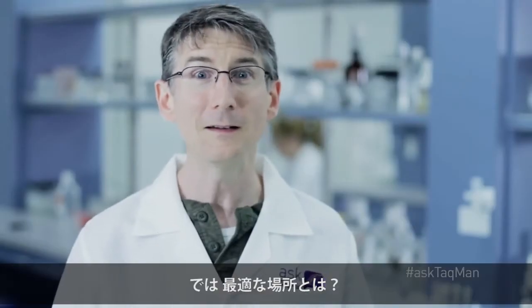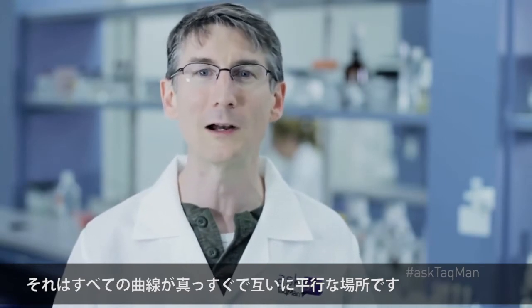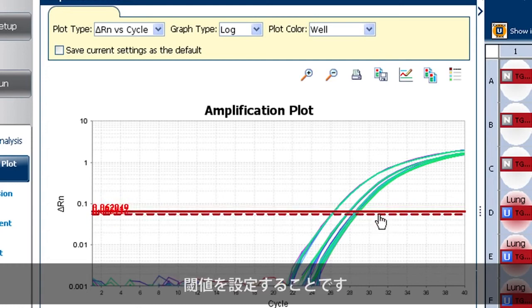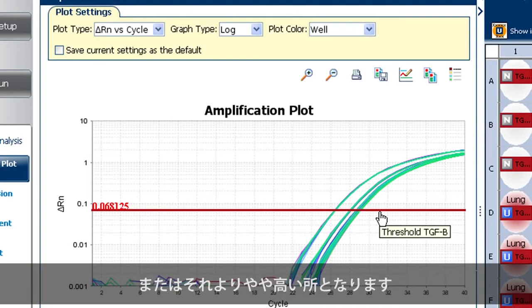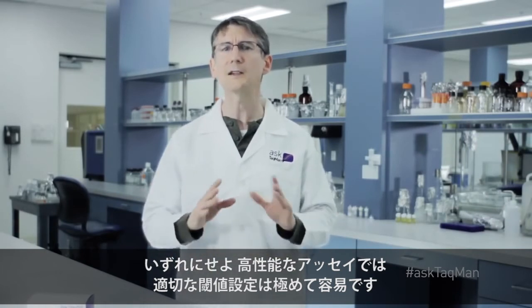A happy spot? Some place where all of our curves are straight and parallel to one another. What we really want is to put the threshold wherever the precision of our replicates is highest. That's generally somewhere toward the middle of the geometric phase, or maybe slightly higher. In any case, with a really robust assay, hitting a good spot is quite easy.